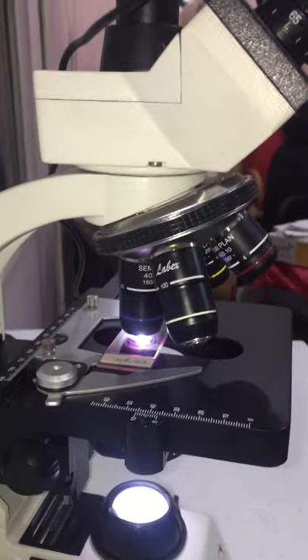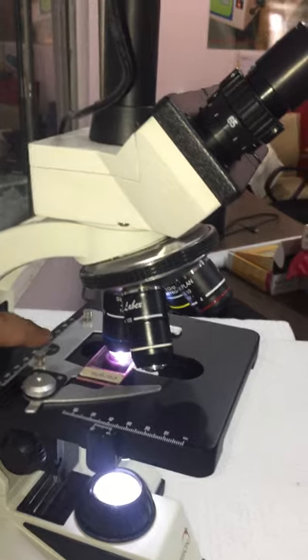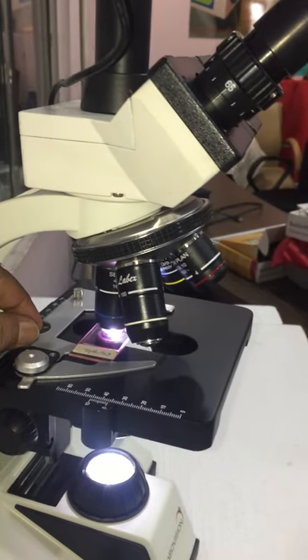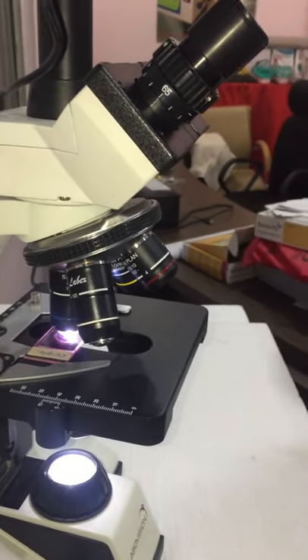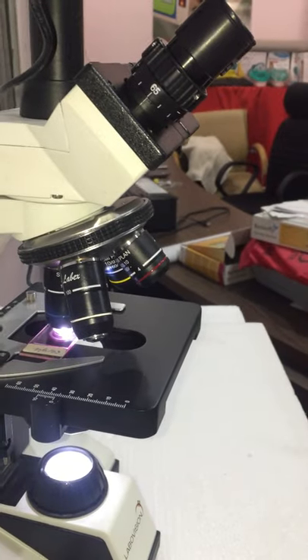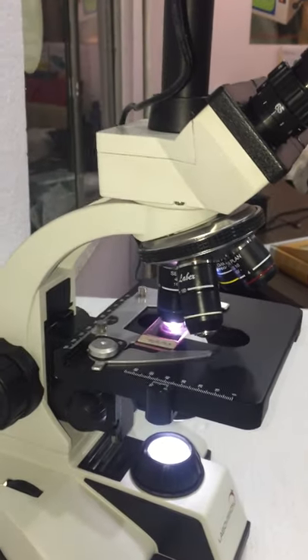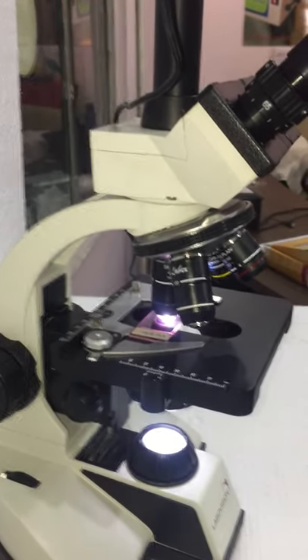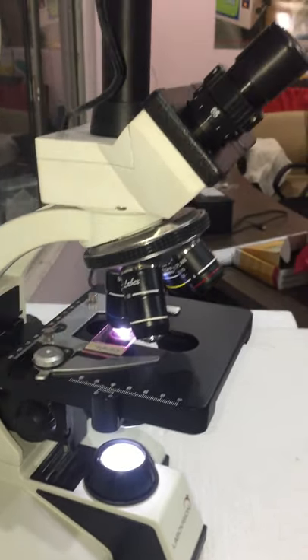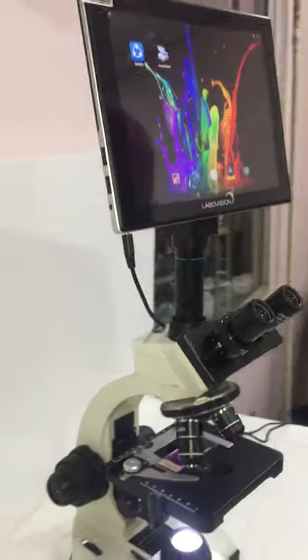The heating stage will be placed after removing the light clips. There is a heating plate controlled by a temperature regulator. We will put the screws back on for the stage clip, and this is what we wanted to show you.